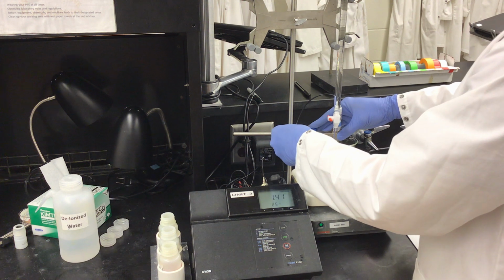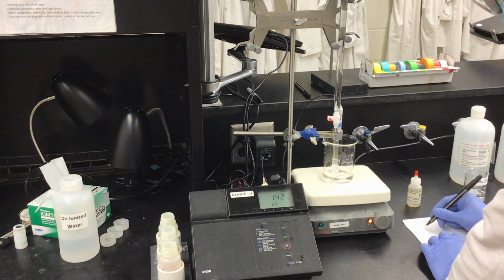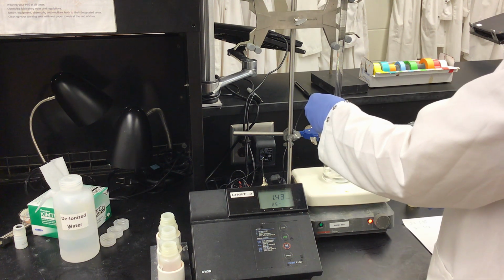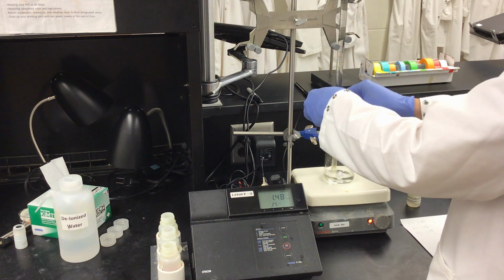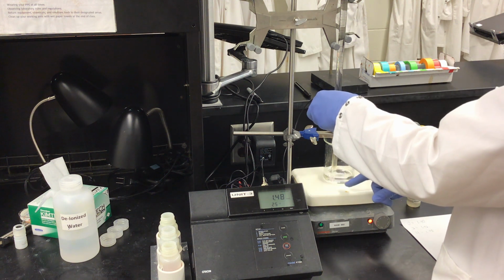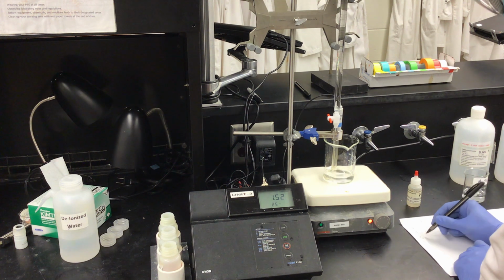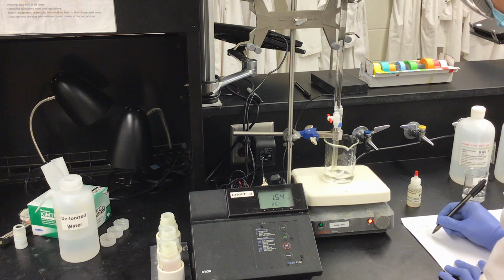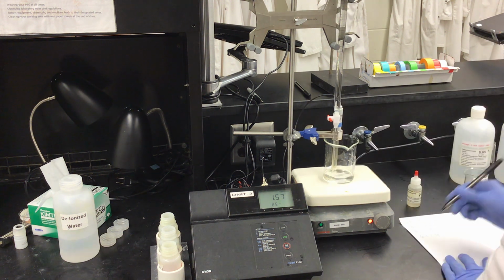So I will now dip my probe into my solution, and after 2 milliliters, my pH is 1.42. Now I will add another 2 milliliters. So at 4 milliliters, we have a pH of 1.48. I will add another 2 milliliters. You can see that there is a slight pink color where our sodium hydroxide is entering our solution. That is our indicator showing the color change. At 6 milliliters, we have a pH of 1.54. As you can see, we are slowly increasing in pH as we go.